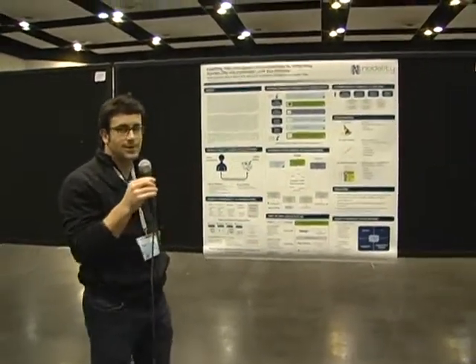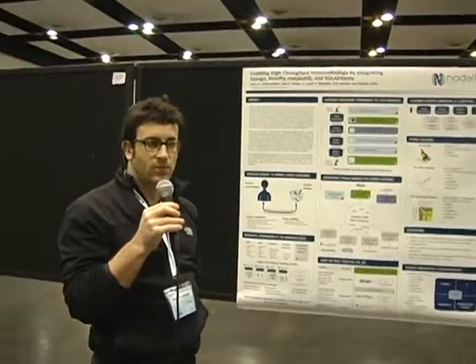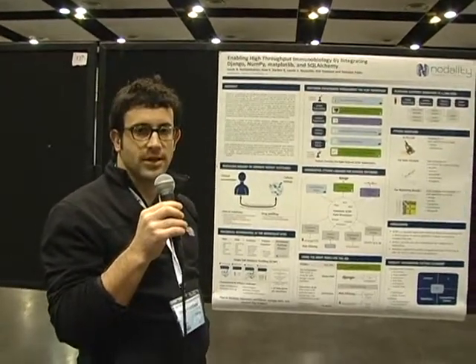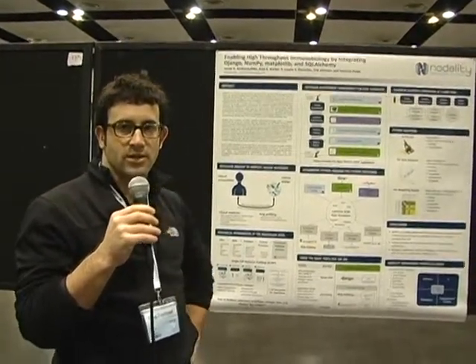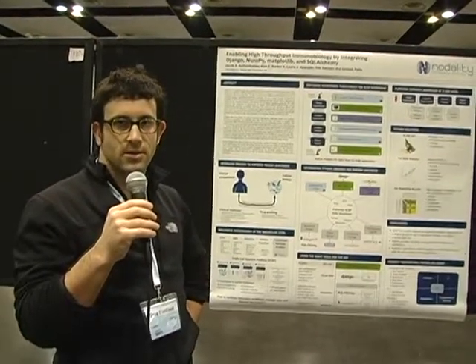Hello, thank you. My name is Greg Friedland, and I work at a company called Nodality. We're a small biotech company, and we have a technology called flow cytometry for measuring biomarker activation and quantity in single cells.